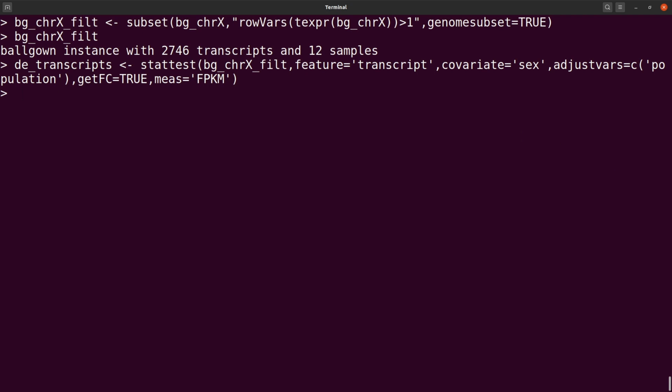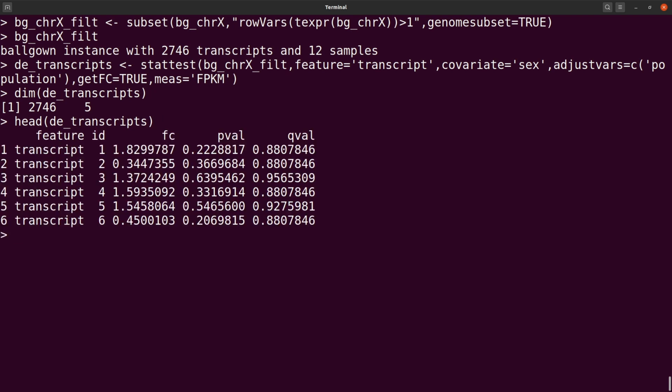Okay, so we have done that for the transcripts. We can just say dim, then that dimension, to get some information here. Yeah, so we have 2746. That's what we had when we did the filtering. So we can say head de transcripts to just look at the outputs. Okay, so we have that here.